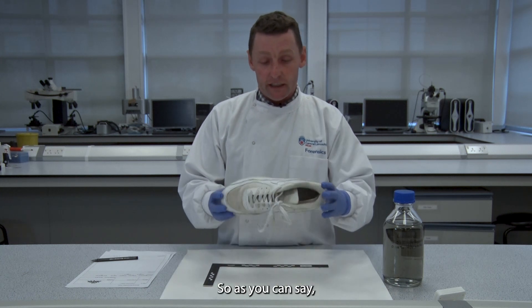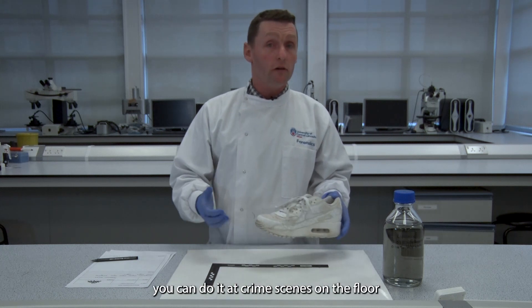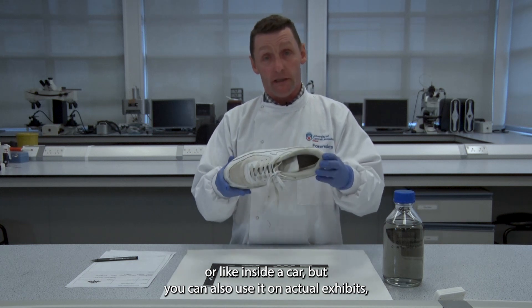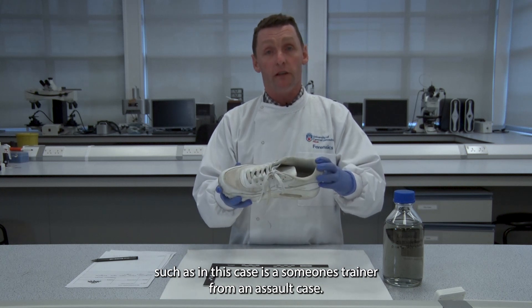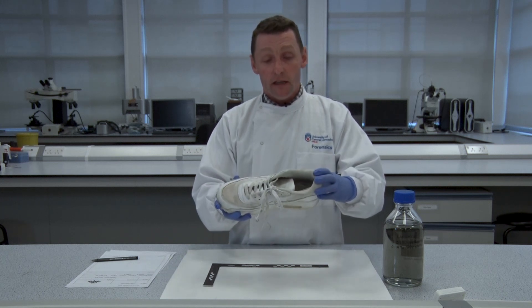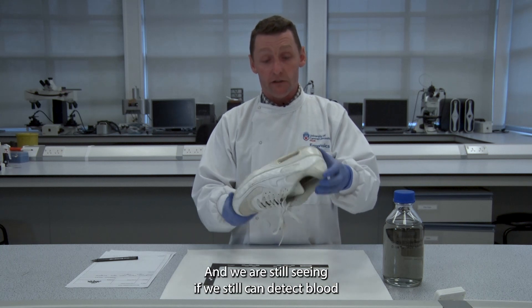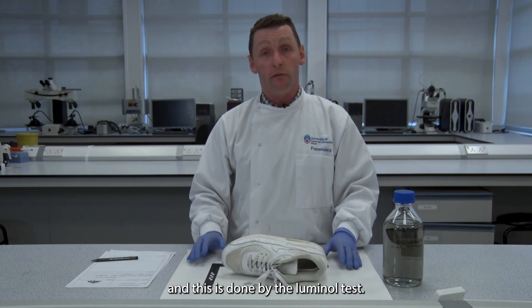You can use luminol at crime scenes on floors or inside a car, but you can also use it on actual exhibits. In this case it's someone's trainer from an assault case — they've tried to clean their trainers and we're testing whether we can still detect blood using the luminol test.